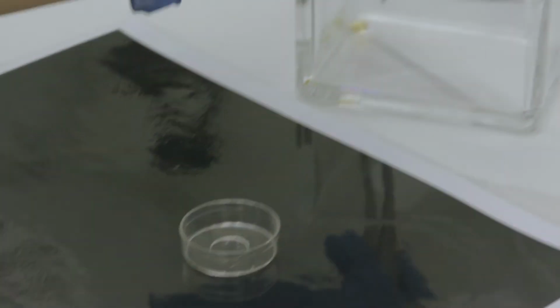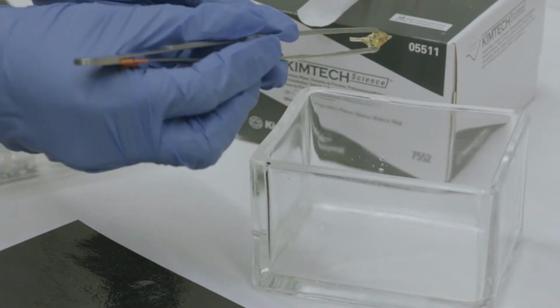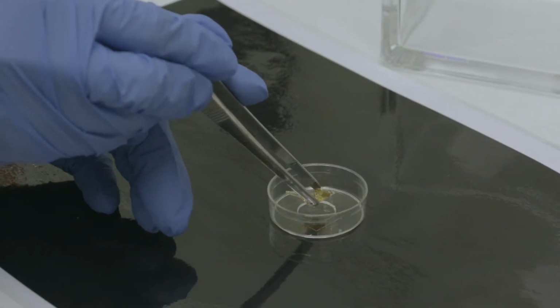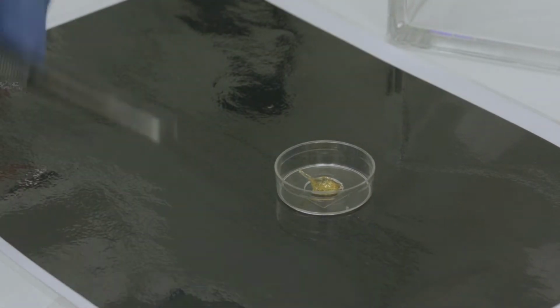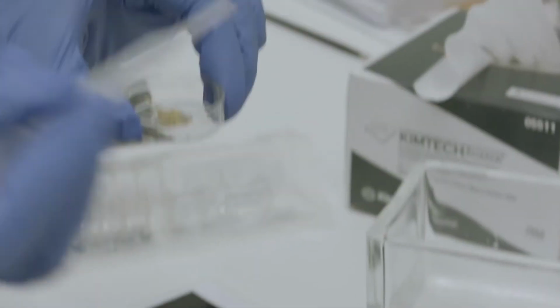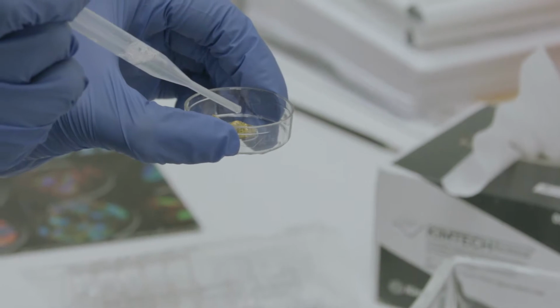So how does it work? I can show you. In this case, we have a quite big sample, which is the whole brain. That's nice. Then what I'm going to do is put the whole brain in the middle, like this. And then it's important that the surface that is touching the imaging part has BABB, so you can put drops like this.